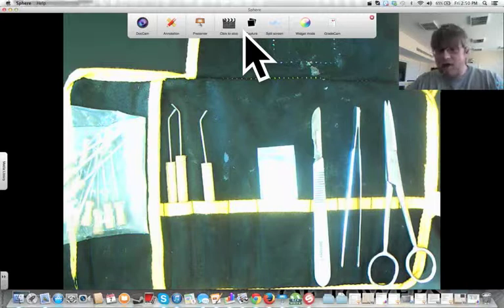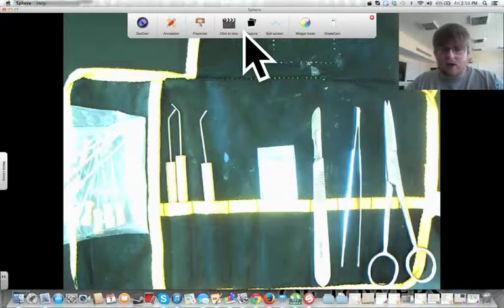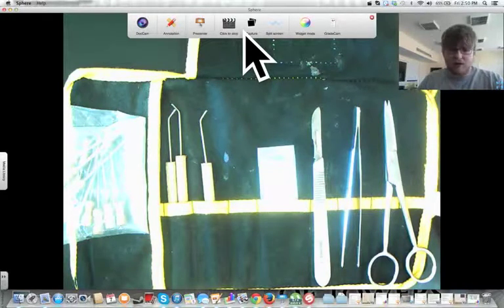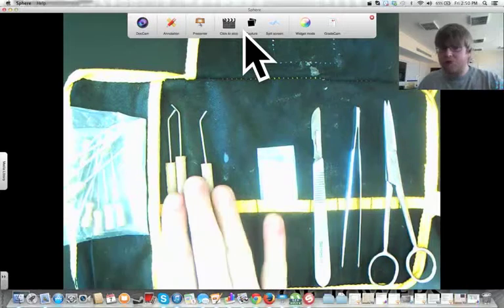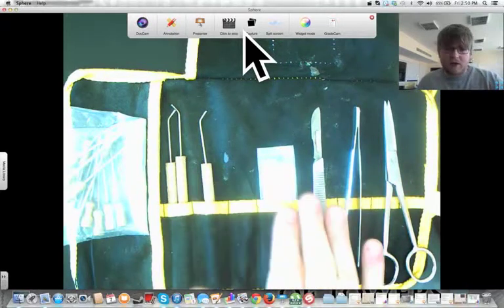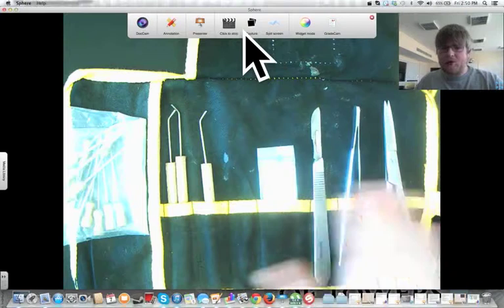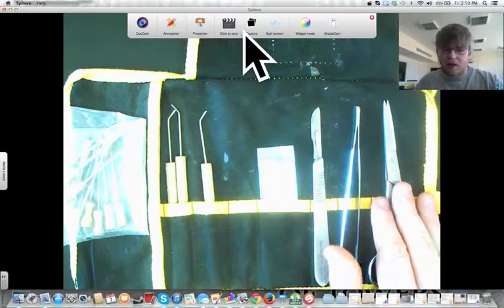In a standard dissection kit, you usually have a couple different things. You'll have dissection pins, probes, replacement scalpel blades, a scalpel, a pair of tweezers, and a pair of scissors.